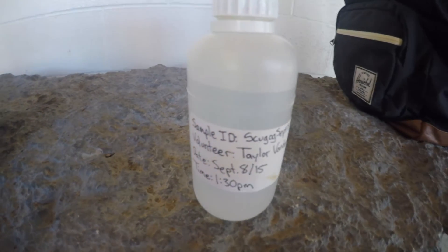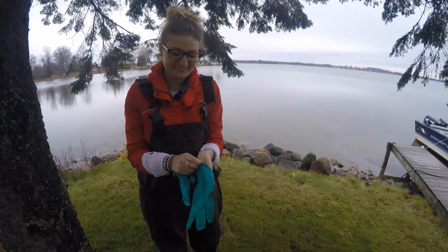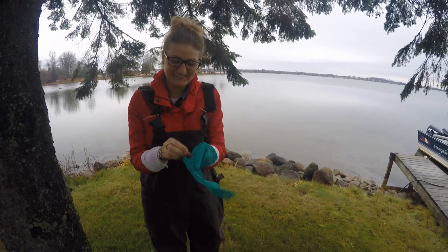Bottles, labels, and chain of custody forms are available for pickup at the KLSA annual spring meeting. Now that we've picked a sample location and received our sample collection bottle, we can begin.